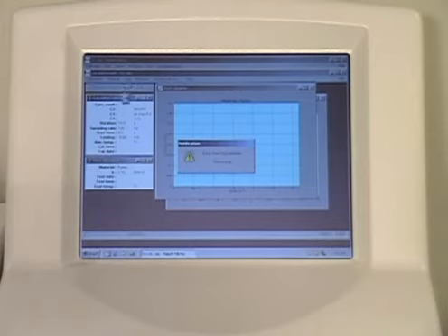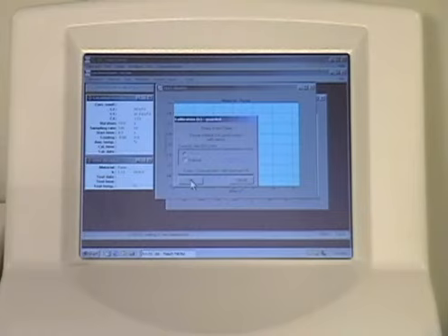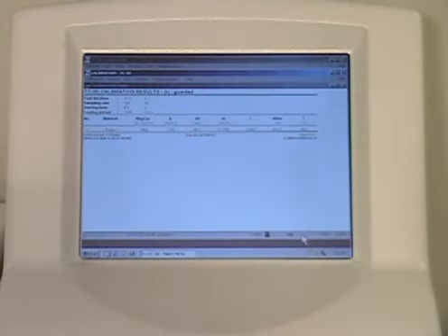Click the Start Calibration button in the top left-hand corner of the screen. This will initiate the first reference material test in your calibration. Then click OK in the next window, which verifies you've placed the correct reference material on the sensor.